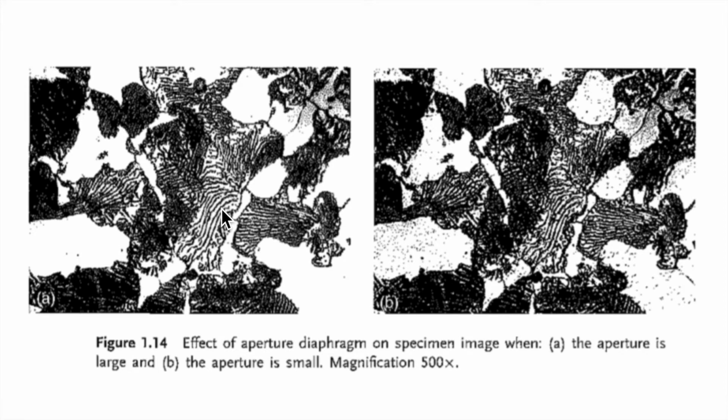And so now I want us to tie it to the images that we actually see. And when we look at these images, I don't know about you, but I don't necessarily see an issue with better or worse resolution or depth of field in these two cases. They're actually fairly similar, but I would say maybe it looks more like a contrast difference, right? And so you can also consider that as well.